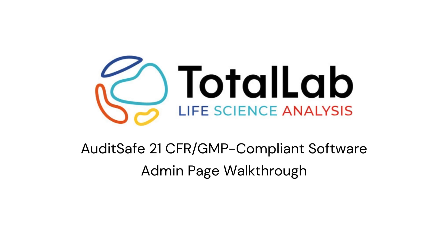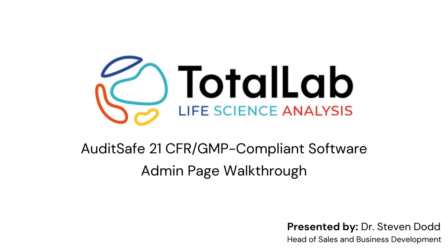Hello everyone, so today I'm going to be guiding you through the admin page of the Auditsafe software where you can configure various parameters of the software, the secure folder, and where you can create users and access project logs.